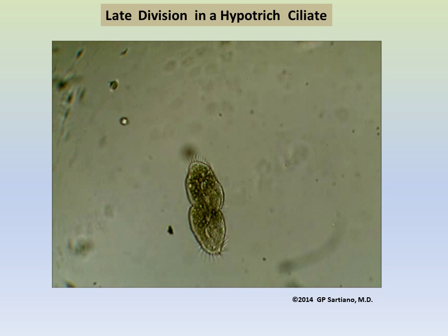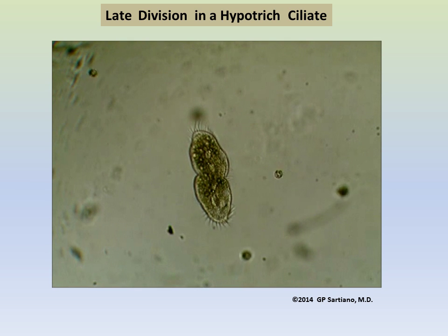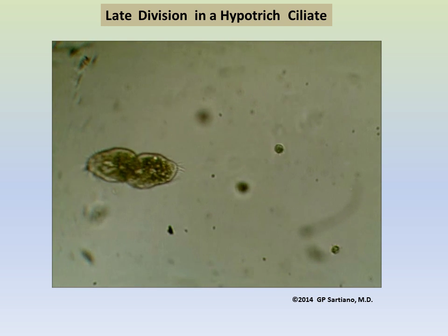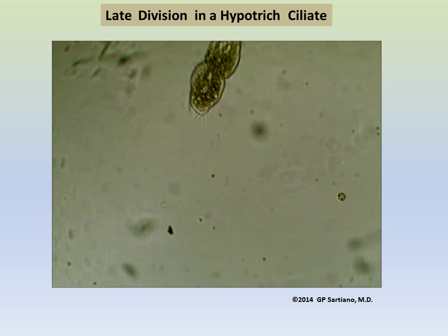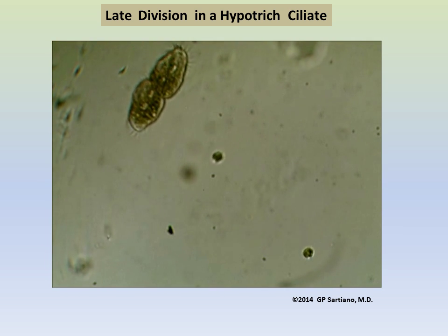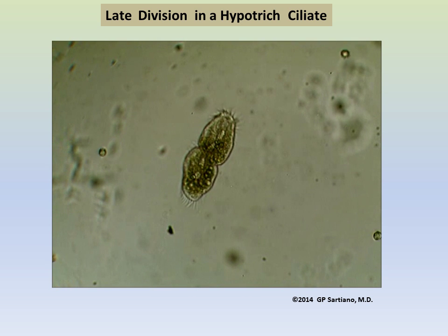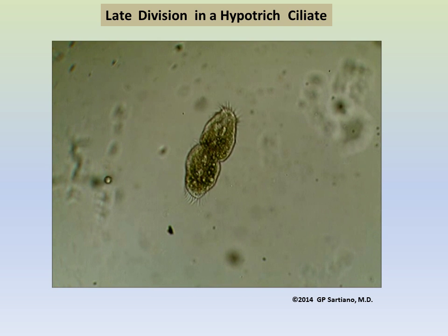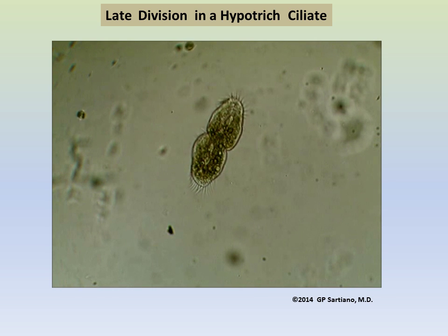The smaller globular organisms jumping, if you will, in the background are halteria. The two product cells appear as though they will ultimately be virtually identical if reproduction continues on its present course.